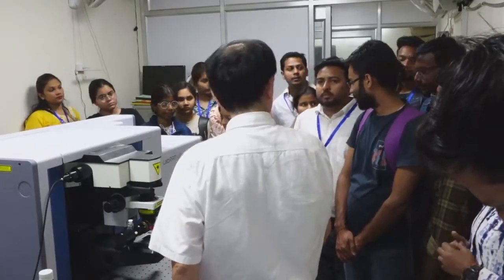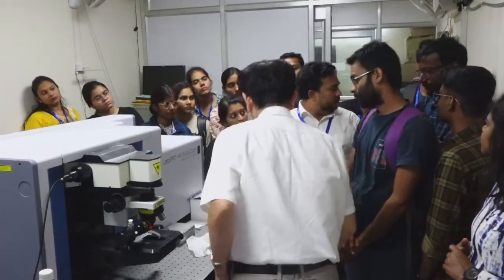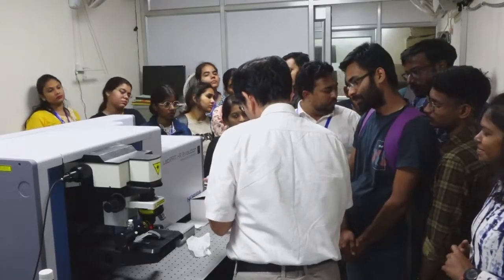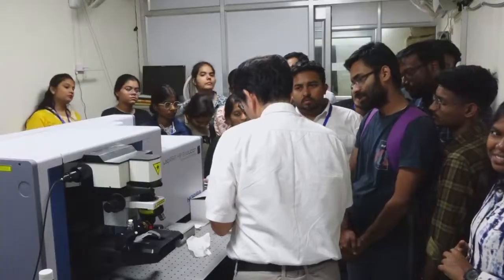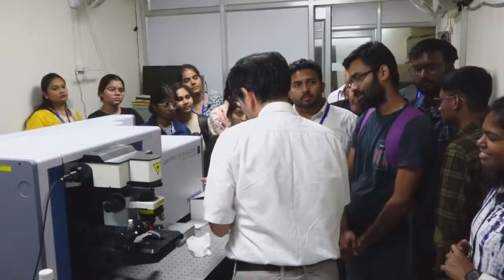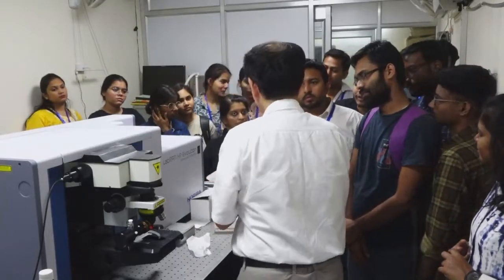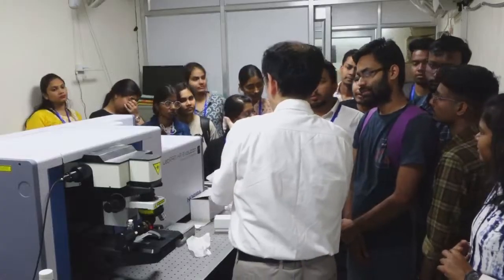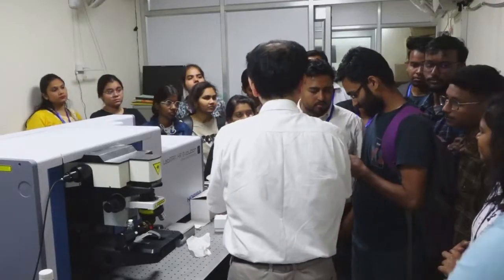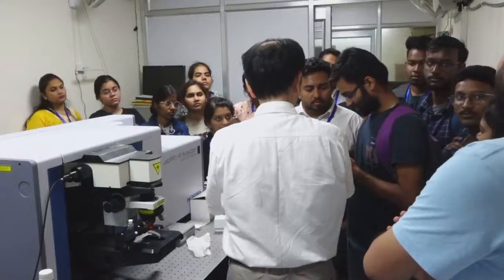Any other question? Is SERS used to study fingerprints? SERS is not a generalized term. It's not used everywhere.